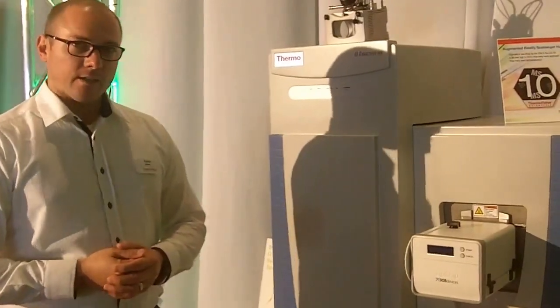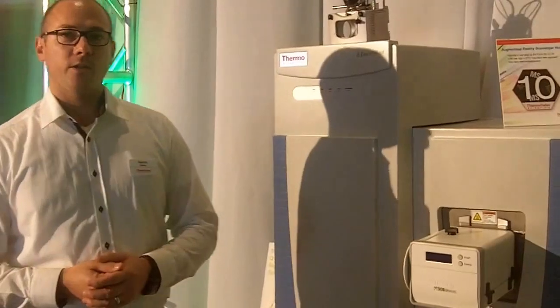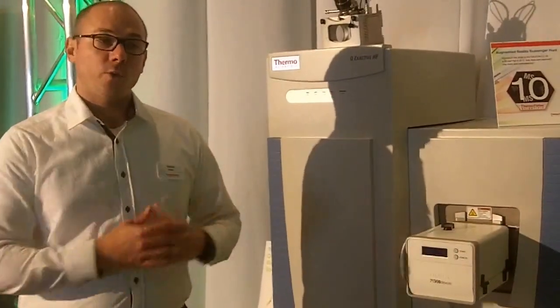This year at ASMS, we're launching the high mass range mode, which is coming as part of the biopharma option for the QE Plus or the QEHF. With the biopharma option, we still have great peptide mapping and great top and middle down, but we've significantly improved the intact protein analysis.